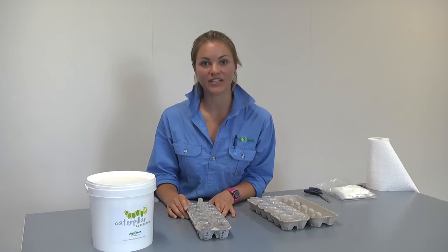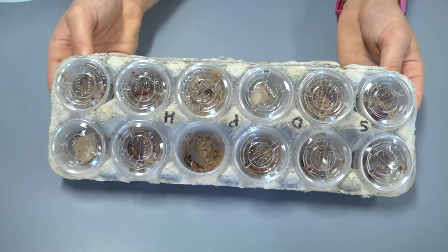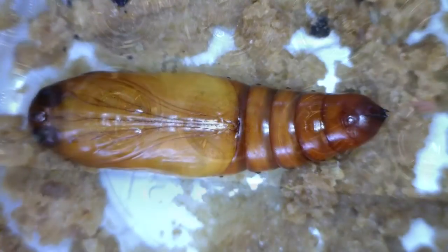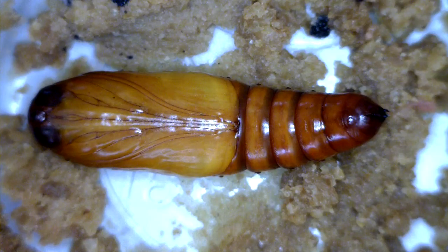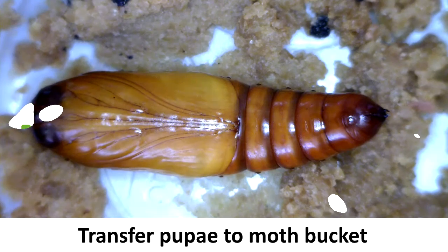You'll notice that it burrows down into the remaining material in the cup to form a pupal chamber. A week or so after the caterpillars begin burrowing to pupate, check to see if the majority of your larvae have pupated. If they have, it's time to transfer your pupae into the moth bucket.